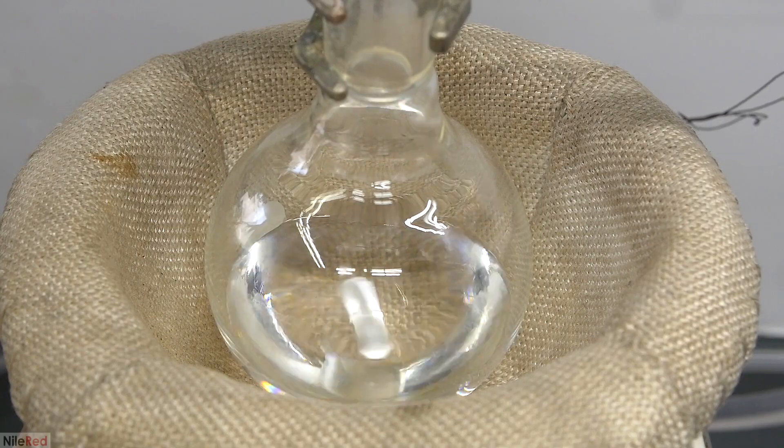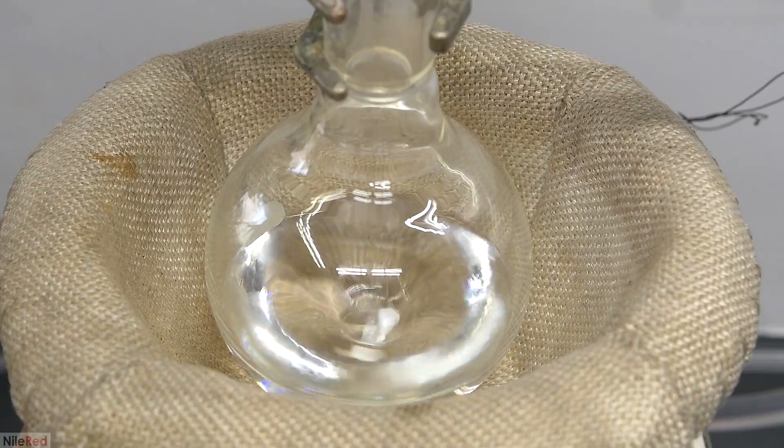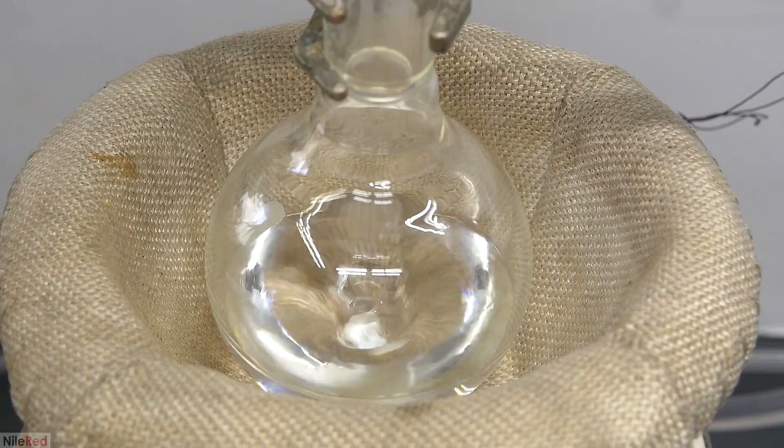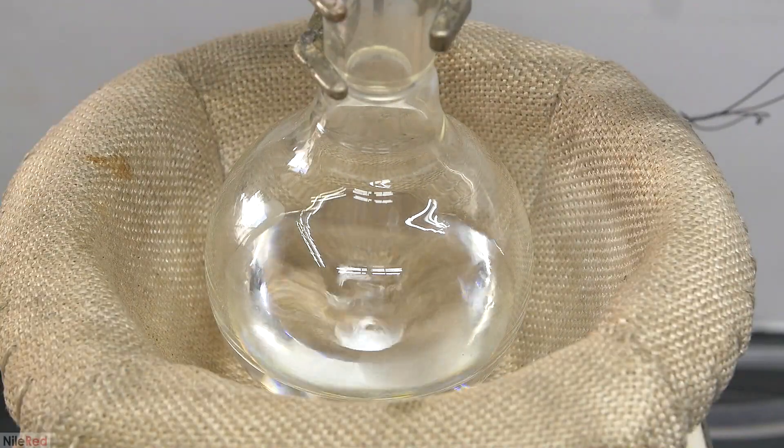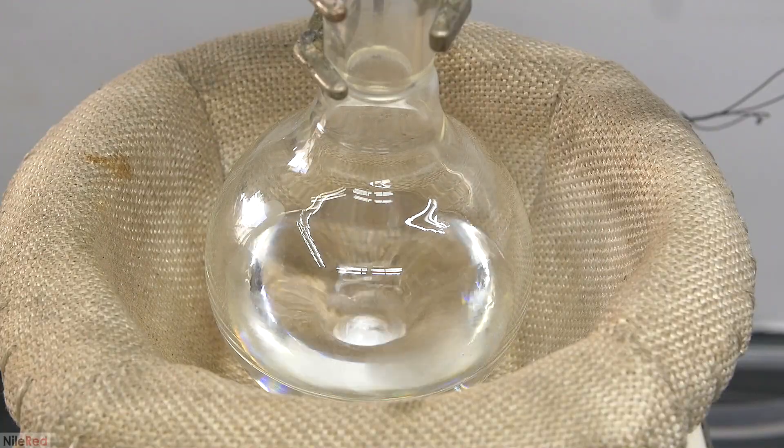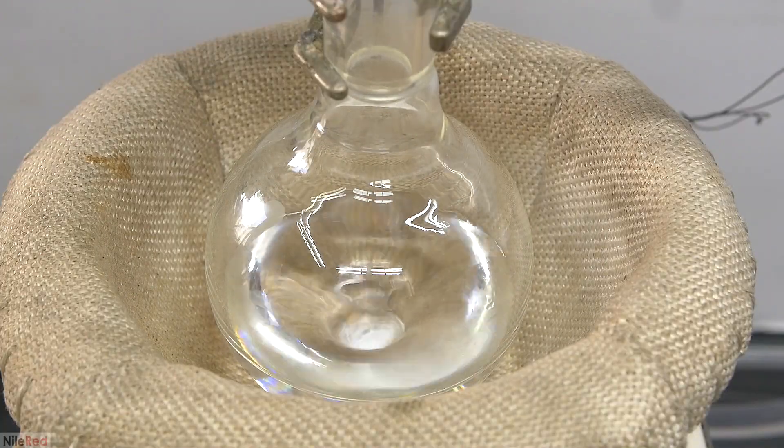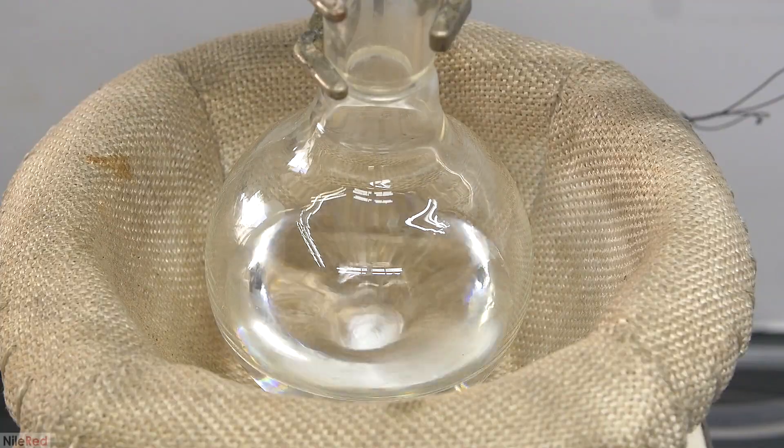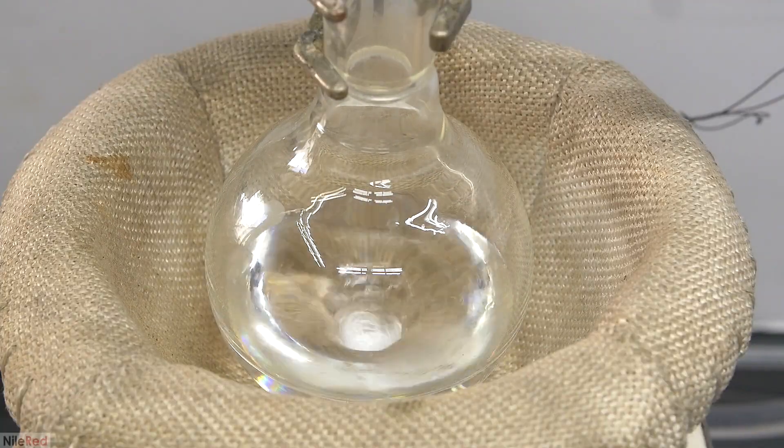When we're ready to get things going, I lower the flask into the heating mantle, and I turn on the stirring. I then turn on my vacuum pump, and not too long after, the benzaldehyde starts to bubble a little bit. At this point, everything's still at room temperature and there's no heating.